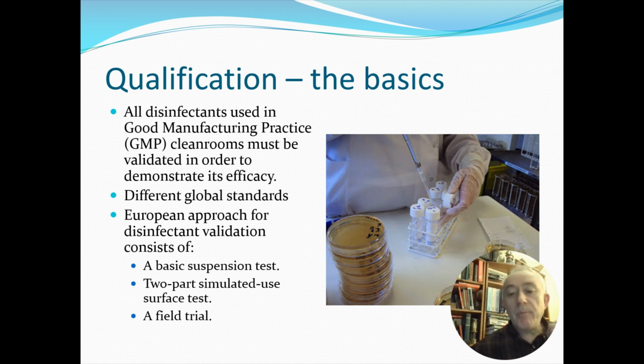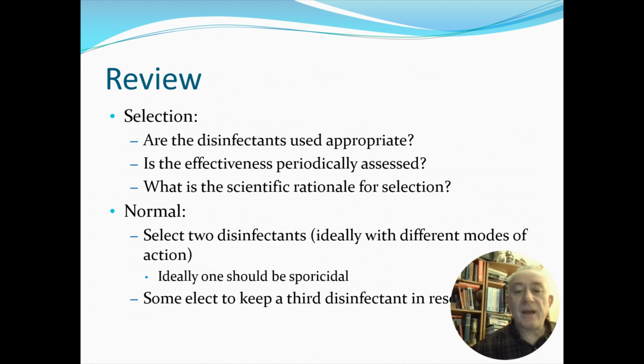But perhaps the most important part of the disinfection qualification is the field trial, and this involves taking the disinfectant into our facility and evaluating how well it performs, and this involves lots of environmental monitoring before and after use and so on. And there are also things that we would want to go back and sense check, particularly before we introduce a new disinfectant into our facility.